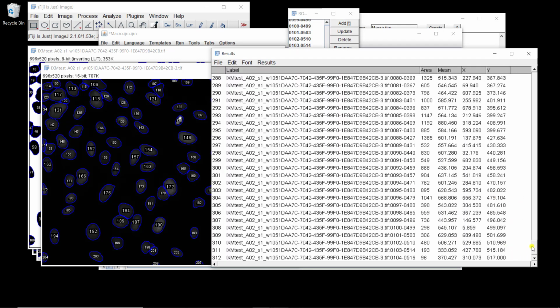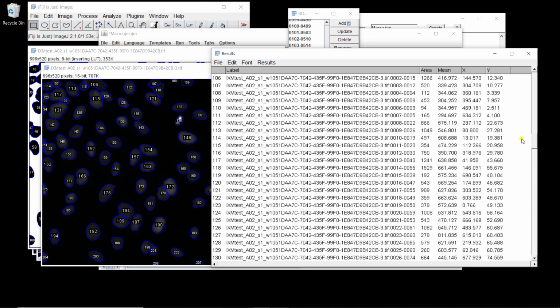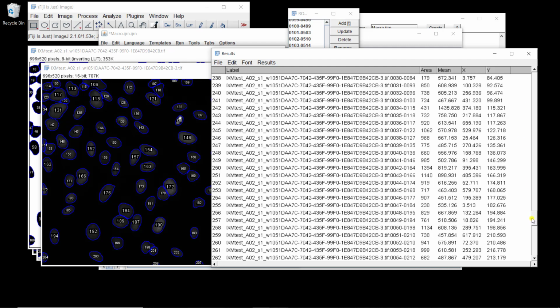If you look at your results, you have first 104 results, so that corresponds to a first analysis, and then as we have as many rows, we should have 208. But if we go to the end, we have actually 312. It's because for the first analysis we had 104 rows. For the second analysis we had the 104 rows for the first analysis and the 104 rows for the second analysis. So we did it twice. So it shows that we need to clear the row manager, otherwise we're going to count several times the same thing, and here it's the same image, so at least it's just a repetition.